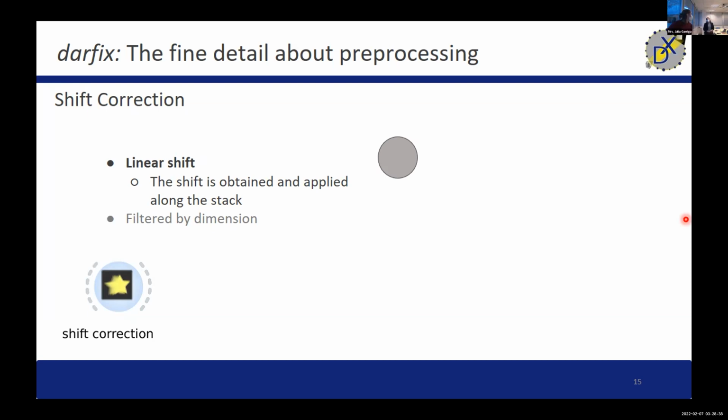I have only ever seen that error pop up when you're overwriting, for example, one shift. Like you applied one and then you want to change it and apply another one. I am not familiar with it, so if you send it again, we'll tell you at the end of the presentation where to send us all the errors that pop up, so we can check them. Then we'll look into it again, because I really cannot remember what that was about.